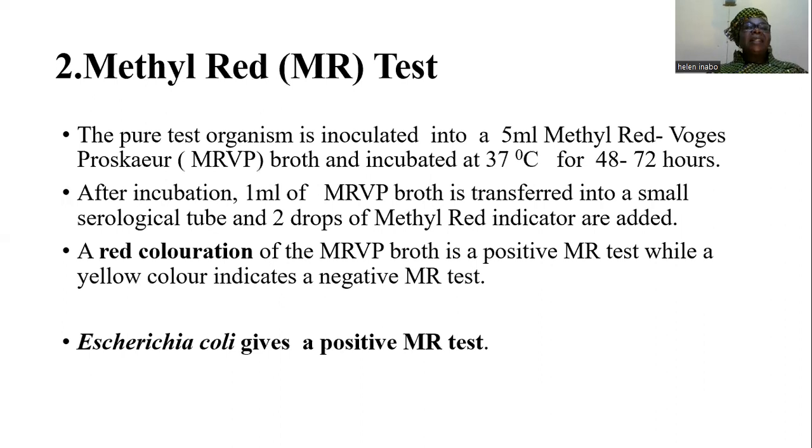The second test in the battery of tests for identification of Escherichia coli is the methyl red MR test.